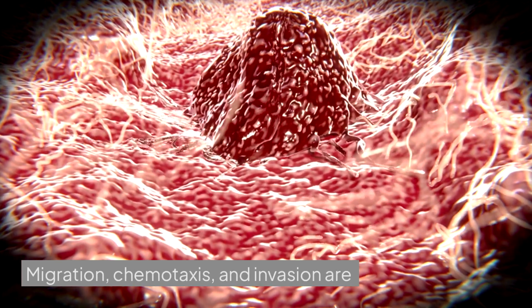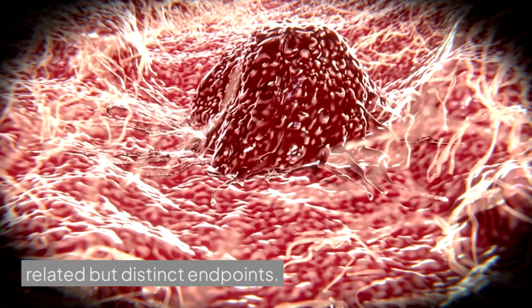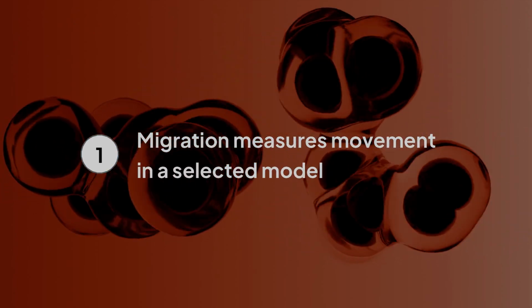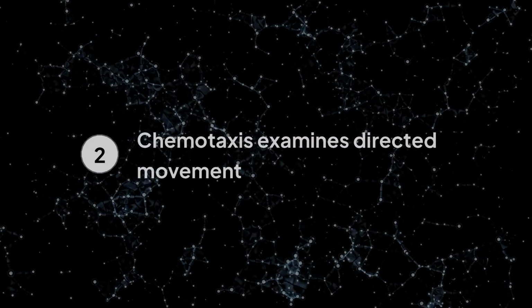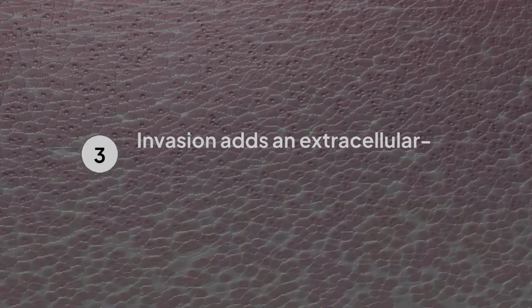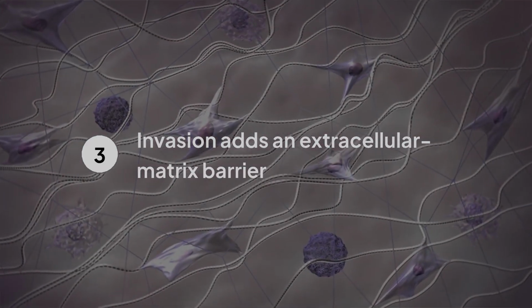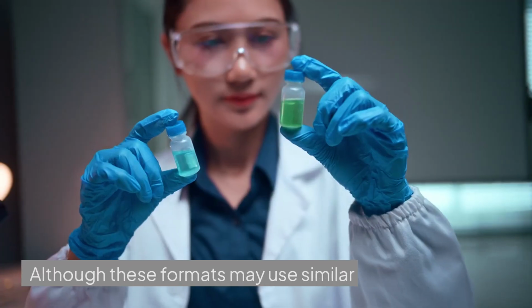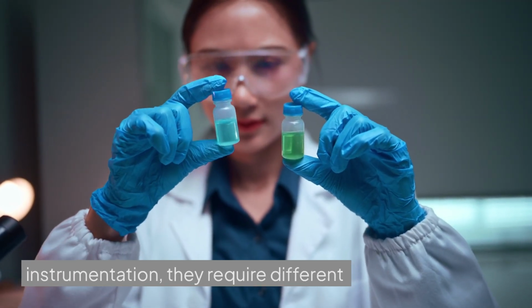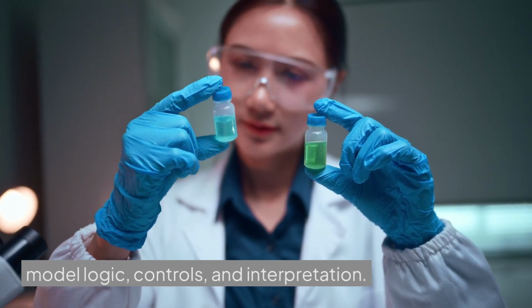Migration, chemotaxis, and invasion are related but distinct endpoints. Migration measures movement in a selected model. Chemotaxis examines directed movement along a chemical gradient. Invasion adds an extracellular-matrix-like barrier that cells must traverse. Although these formats may use similar instrumentation, they require different model logic, controls, and interpretation.